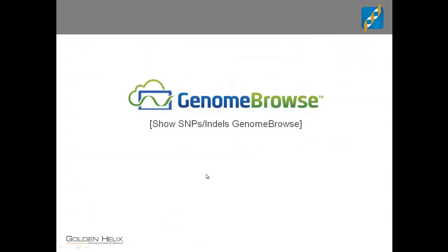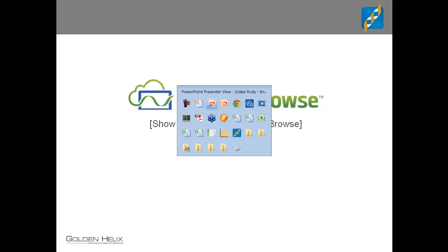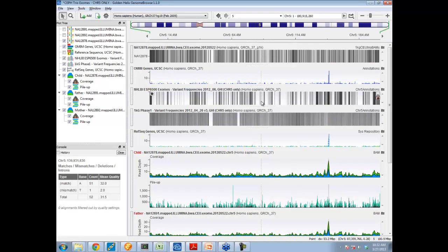We've been blazing through the background — we know what SNPs and indels are. Let's jump into Genome Browse, a free tool you can download from our website. We're going to use this to show a couple of sites that are clean SNPs as well as some sites that can be problematic and why you need to look at this data down to the read level.